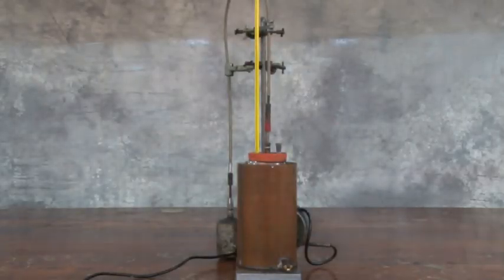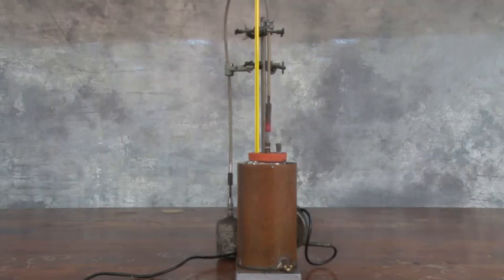Okay, welcome back. So here's the experimental setup once again so you can familiarise yourself with it. The calorimeter is a vacuum sealed dewar flask with a rubber lid, an electronic stirring mechanism which you can see turning, and a highly accurate thermometer.